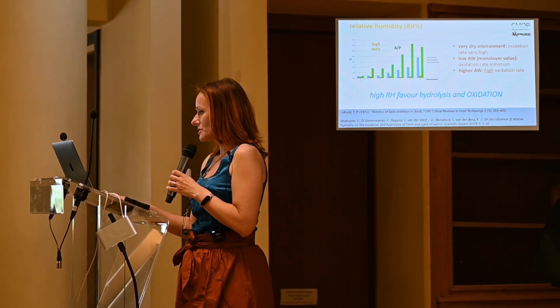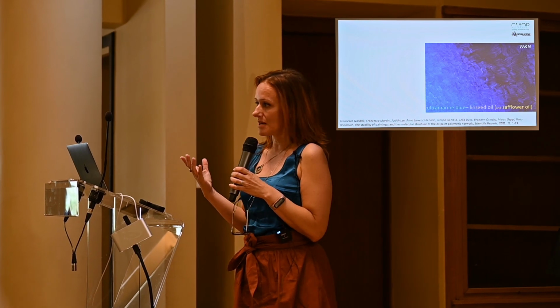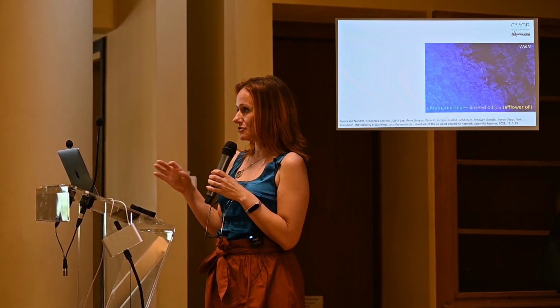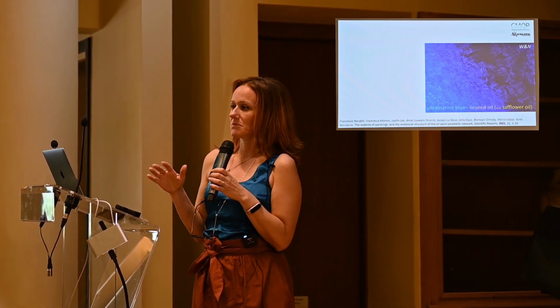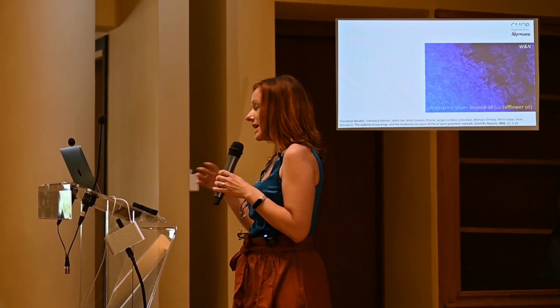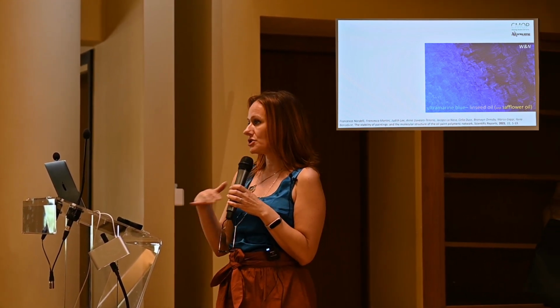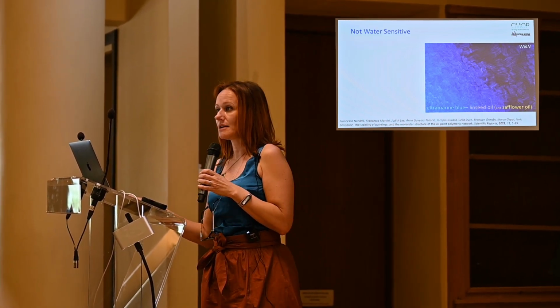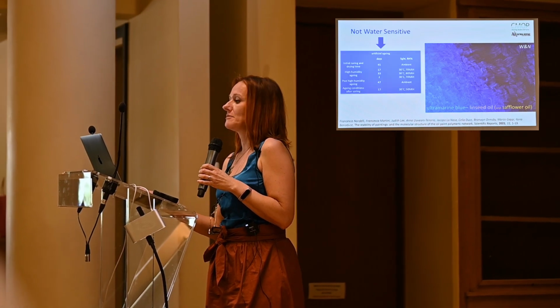So by the end of the project, we came across the perfect set of samples, let's call it. It was ultramarine blue from Winsor & Newton. We prepared model paint layers straight from the tube, and they were just left to cure. One set was kept in normal conditions, and the other one was exposed to high relative humidity. The control that was not artificially aged was not water sensitive, and the one that was exposed to high levels of relative humidity became water sensitive.